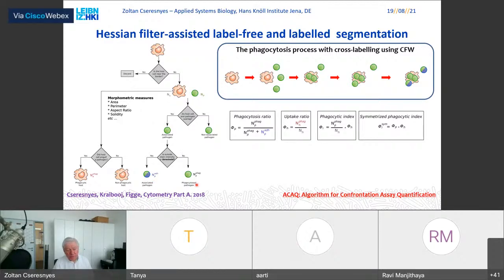The other group will be pathogens which are green but not blue and they overlap with the macrophage. Since they are not blue, they must be inside, protected from the blue labeling. That is, these are the so-called phagocytosed pathogens.